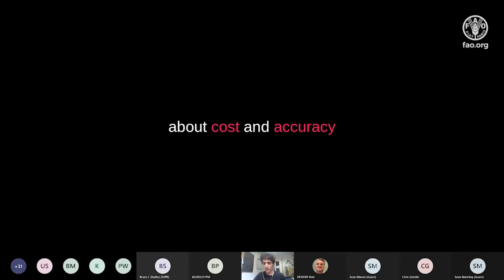As you can see, we've been doing the research thing, where you want to publish papers and go for the highest accuracy possible, and that naturally brings you to MIR. We are now at the point where we're trying to question whether all applications need those sorts of accuracies. If you're into something like spatial modeling at national scale, maybe something out of NIR might actually be better.